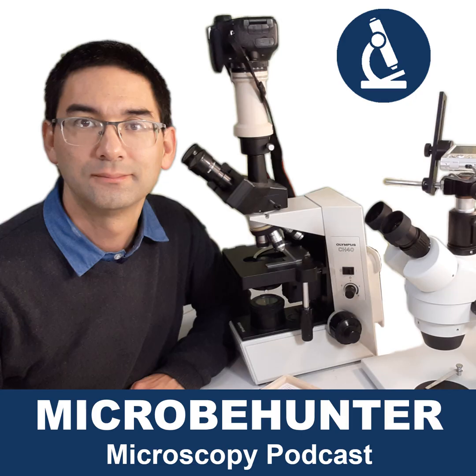And basically, this means that if the refractive index of the organism, however, is the same as the surrounding medium, then even those methods will not work quite well. And this is one of the reasons why you have to really be careful if you use unstained specimens, and if you want to rely on phase contrast microscopy, for example, you have to make really sure that the surrounding mounting medium has an appropriate refractive index. Because in the worst case, the specimen would have the same refractive index and also a very low color contrast. So then it's going to become even more difficult.